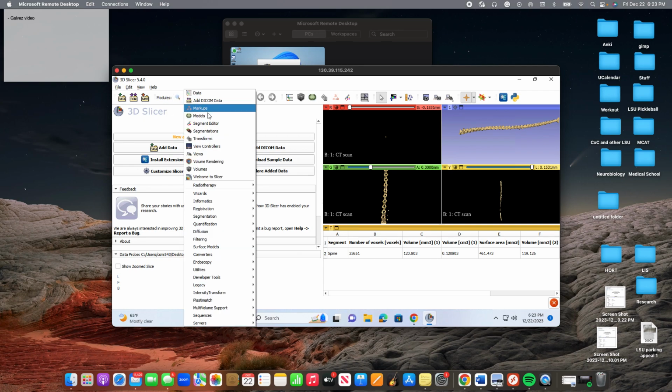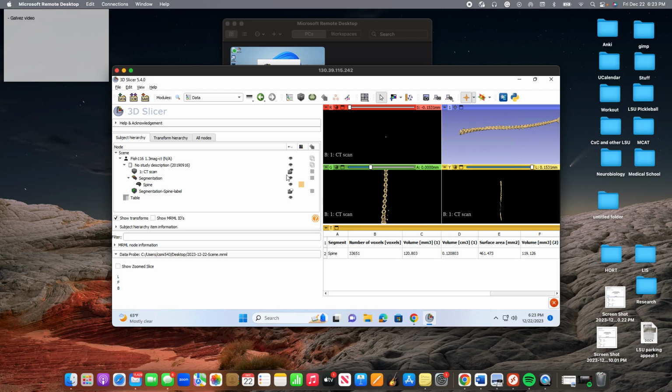So you can go back to data. I think this is what it is. Yeah. So what you can do, and I think it's, there you go.